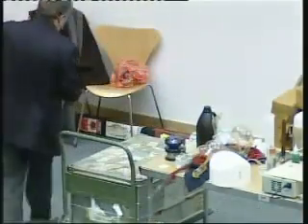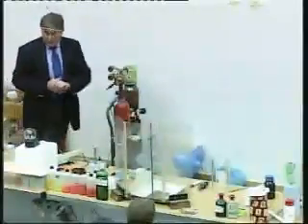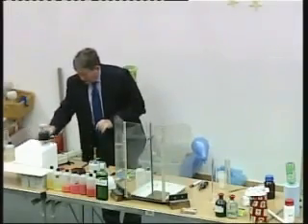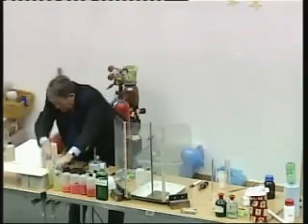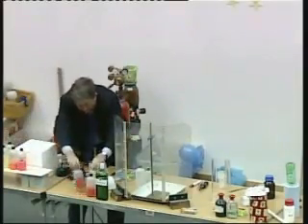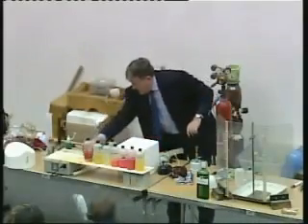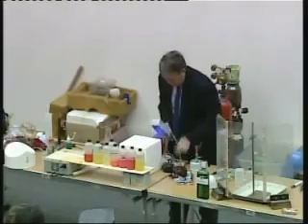Well, other things, as I said, luminescence happens when you excite molecules. They can give out their energy by giving out light. And so I want to show you just a couple of things relating to luminescence. I've got a whole range of dyes here, laser dyes in fact. The one I wanted isn't there. Oh, is it? No, didn't bring it, never mind. I'll have to use the other thing instead. Right. Let's take that off.